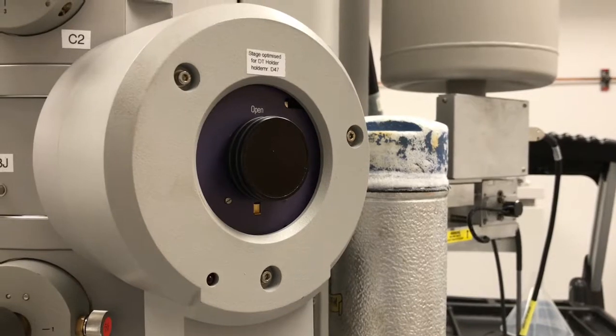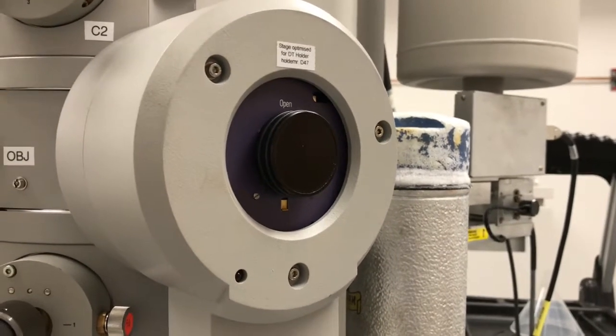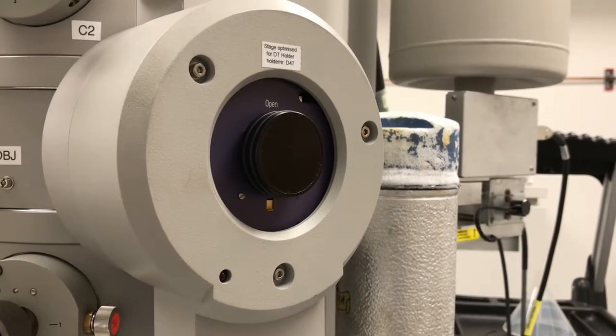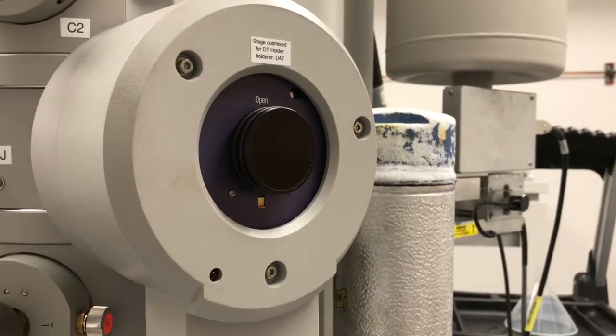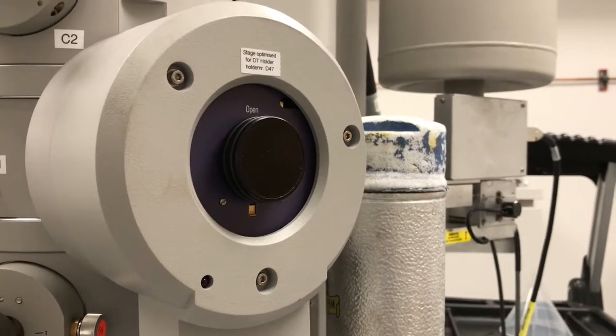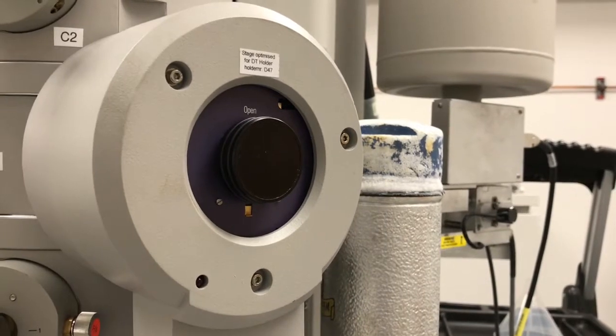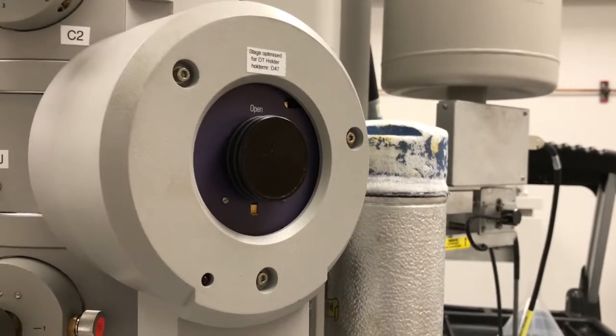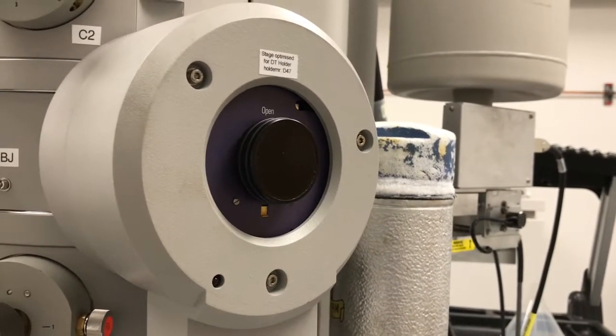To extract the holder, the basic process is that the holder is pulled out until a stop is felt, then it's turned clockwise approximately 120 degrees until another stop is felt, and then it is pulled all the way out.